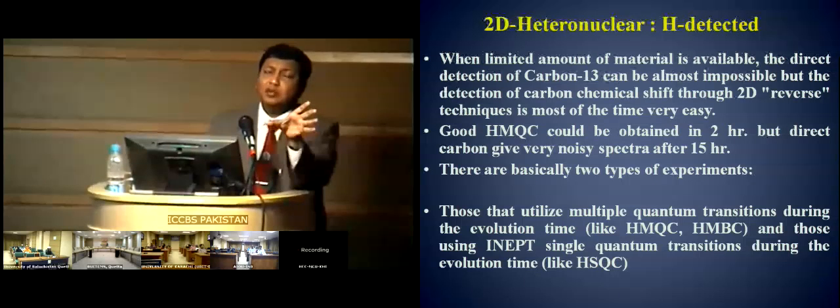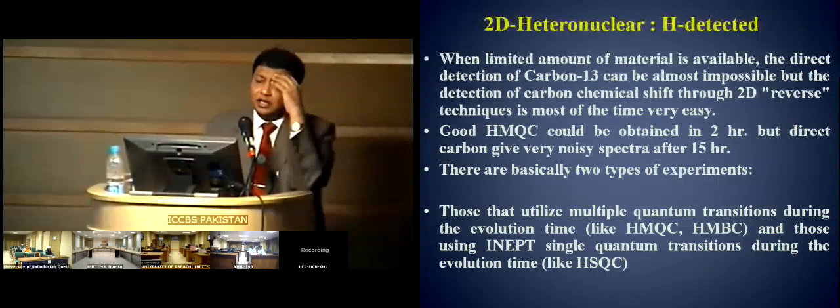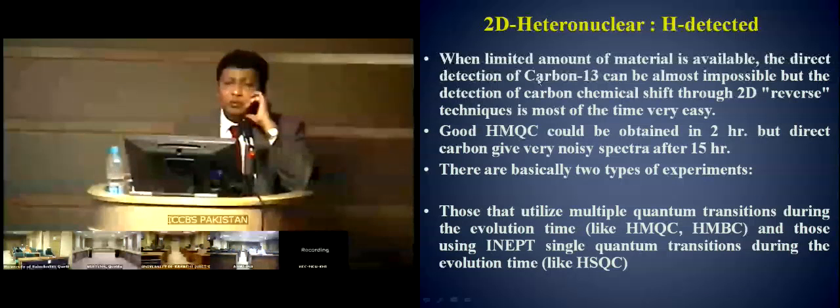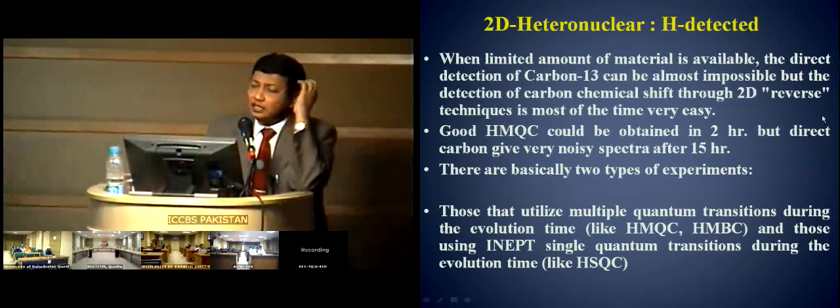But actual C13 NMR spectra are always polarization transfer. Without polarization transfer, nothing is done. So this whole set of new NMR experiments were developed, which are called reverse or inverse NMR techniques.